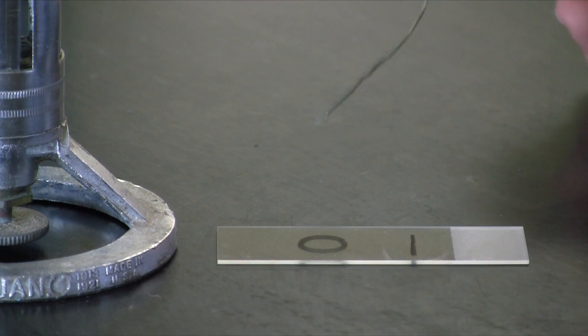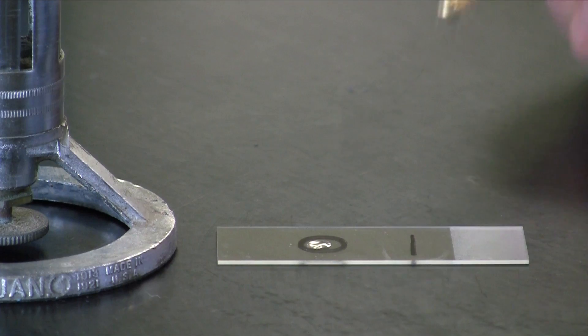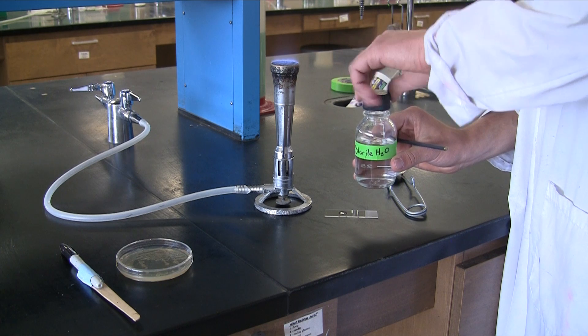Remember that the water is sterile, so be certain to flame the lip of the water and be certain to flame the loop each time you go in and out of your water so that we can keep that sterile water sterile.